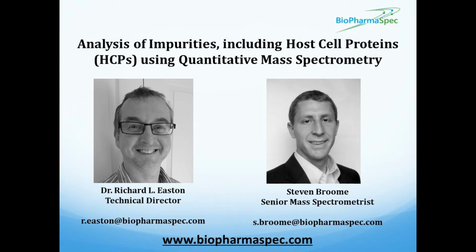Sure. Okay. Well, thanks for that, Steve. You touched on one point there that I'd like to follow up on briefly, and that's host cell proteins. Obviously, that's a huge area as far as analysis goes, and mass spectrometry is playing a significant role in analysing these. Could you just say a little bit about how mass spectrometry compares to more classical ELISA methods for analysis of HCPs?